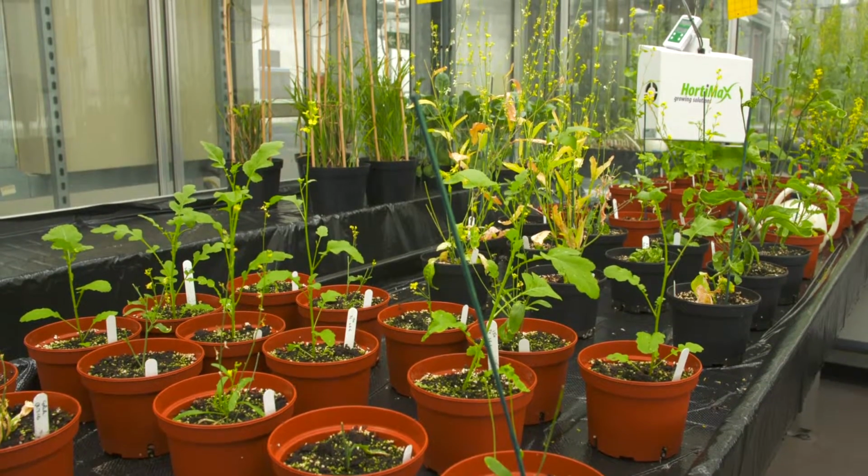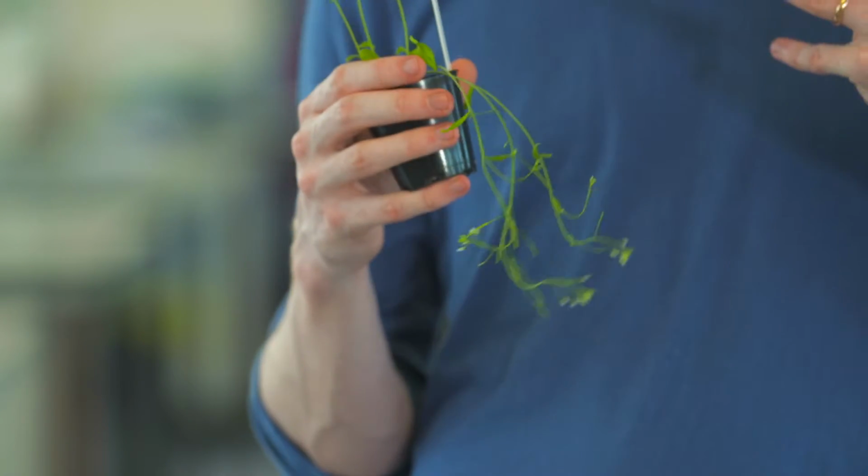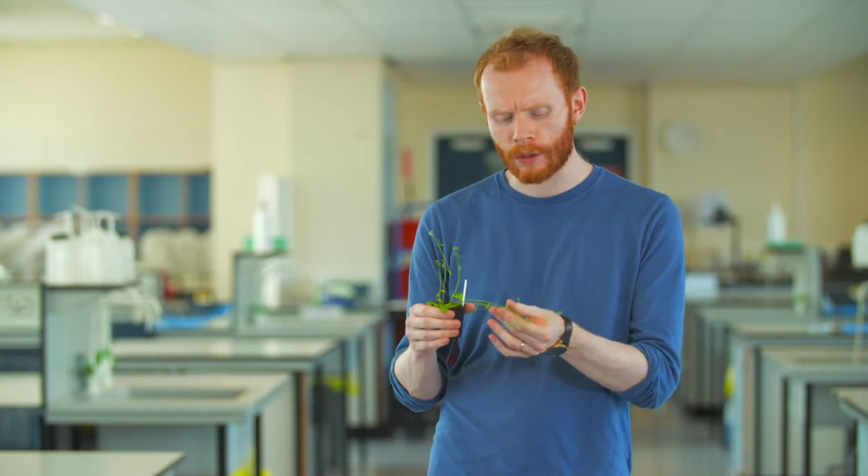And we're also using CRISPR here in the University of Birmingham's School of Biosciences in order to create specific mutations in this, the model organism Arabidopsis thaliana, in order to understand more about a process called meiosis. But how can we tell if we've created a mutation in a plant's genome? After all, DNA is incredibly small, impossible to see with the naked eye.